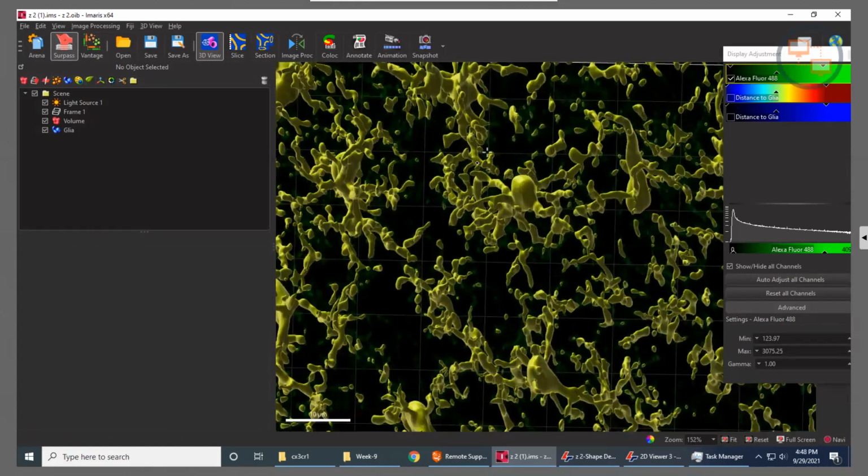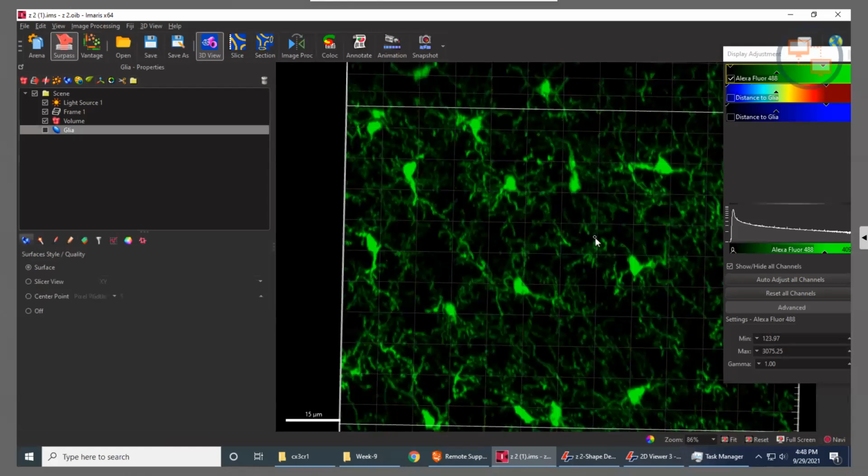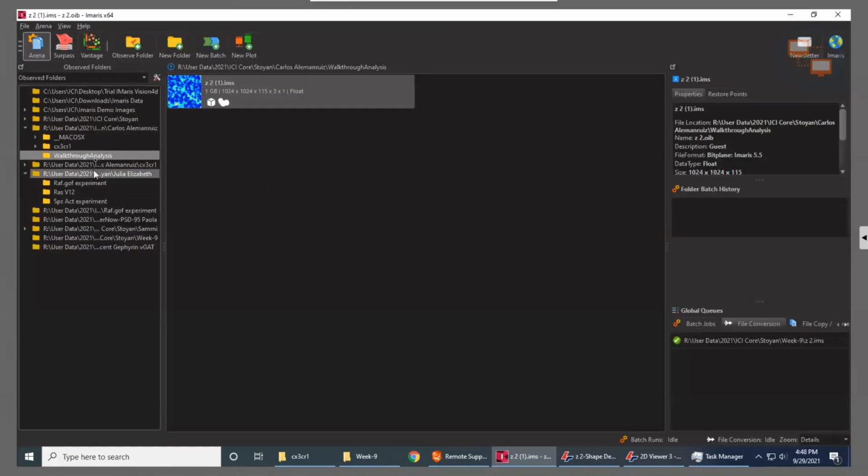This is one where I've run that algorithm on the whole volume. Yeah, that's kind of what it would look like. But yeah, it's bizarre.